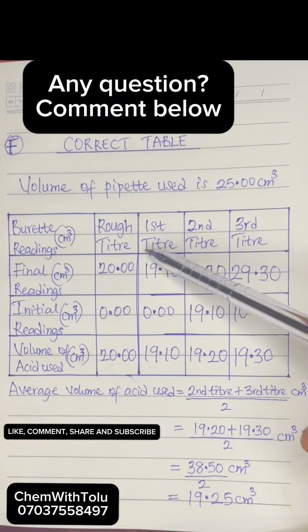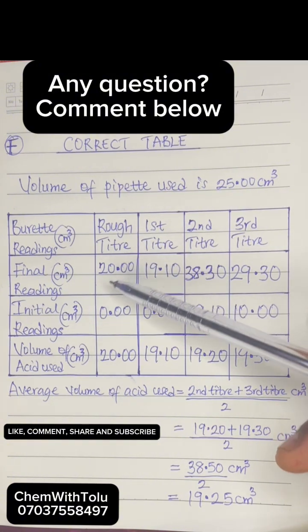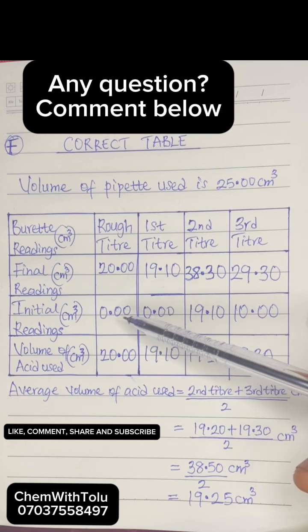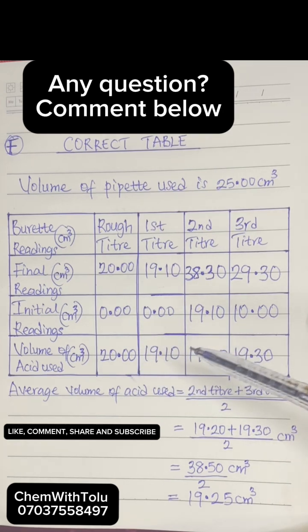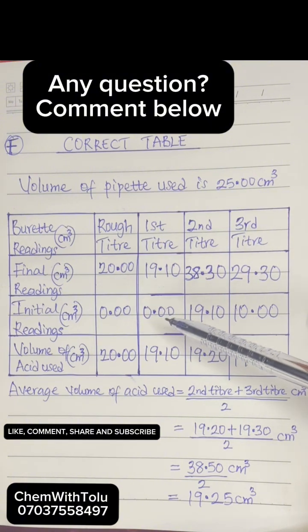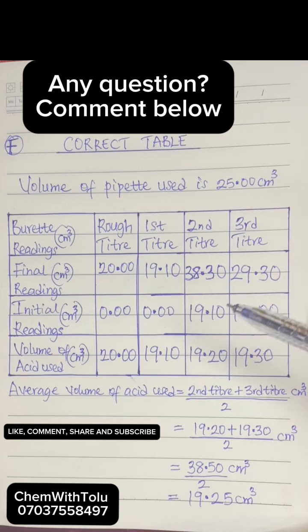And then next thing, for your rough titer, you can see 2 decimal places, 2 decimal places, and 20.00 minus 0.00 is 20.00. No arithmetic error. 19.10 minus 0.00 is 19.10. You can see 2 decimal places and no arithmetic error, no burette reading error of 50 something. Now, if you look at this, you have 38.30 minus 19.10.